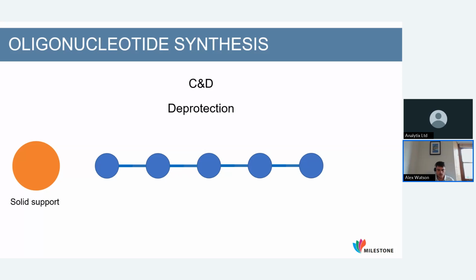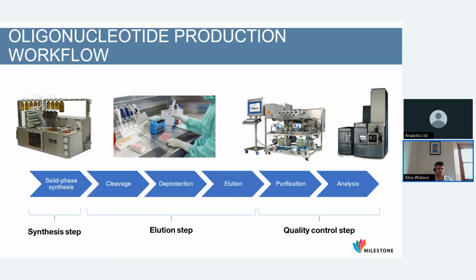By adding water or any aqueous solution, we elute the oligo away from the solid support, collecting the oligo. So that's the synthesis and C&D process illustrated. And that would be our final product, on which we do downstream purification steps, QC and analysis, before storing the final product, typically via freeze drying.